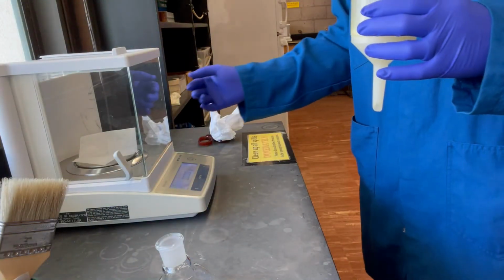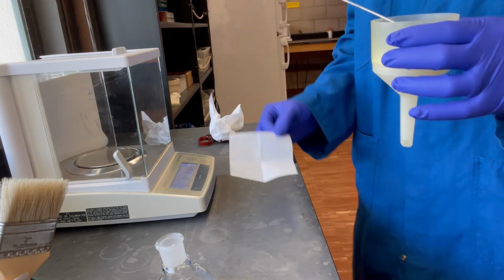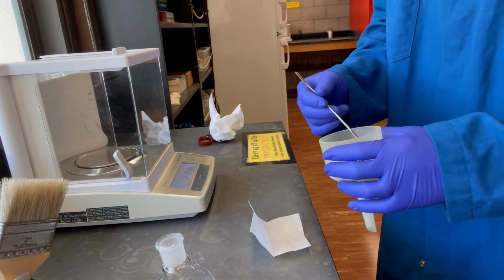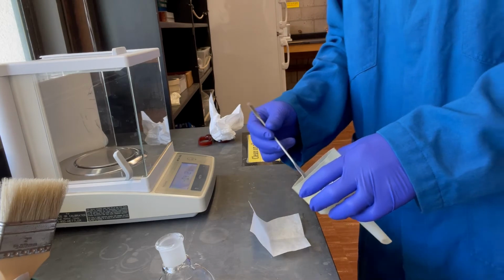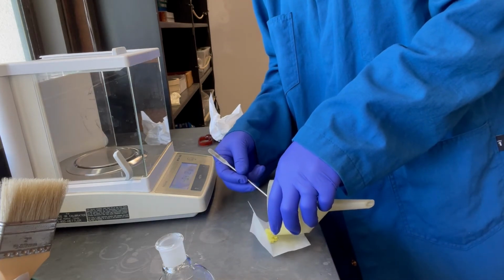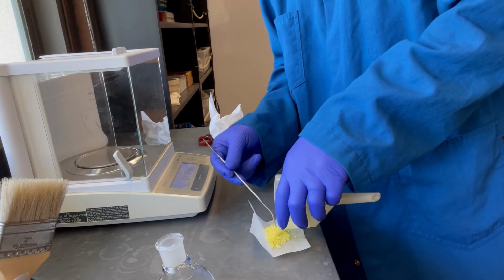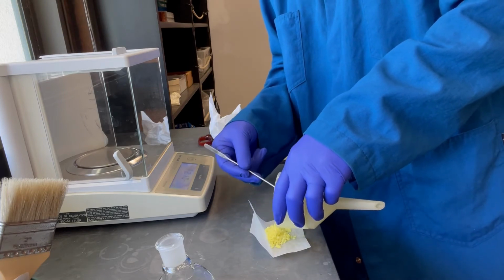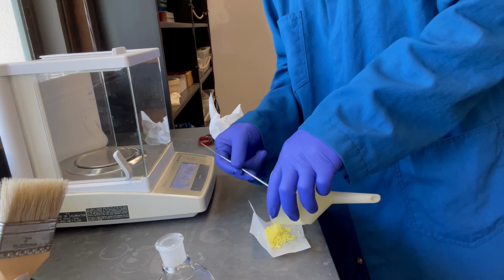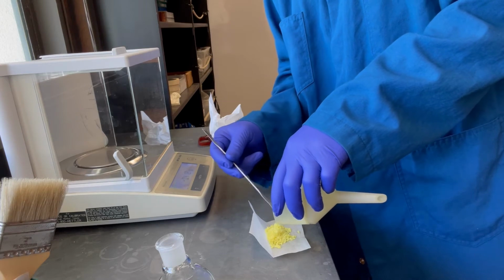Dope. All right, y'all, we want to weigh our stuff. I already tared this weigh paper here. So now what I want to do is just throw our solid material right on top. I dried this probably like 10 minutes. It's actually pretty crispy already.